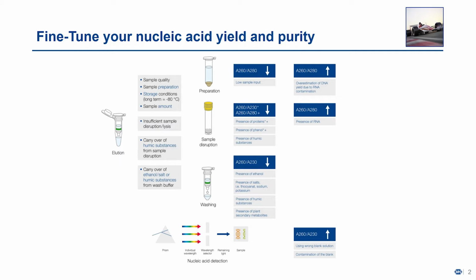First of all, don't panic. We will show you the steps during the protocol that are important to obtain a high quality and purity of your nucleic acid. In addition, we will discuss several solutions to help improve your overall quality and yield.